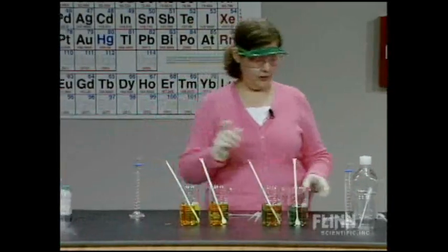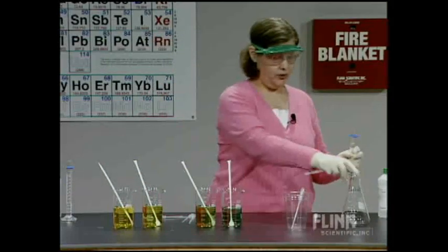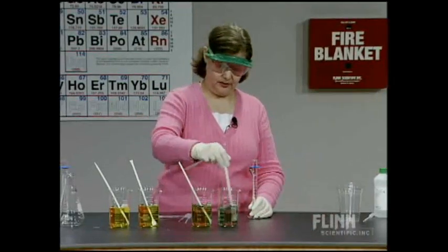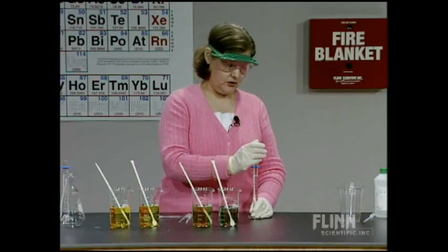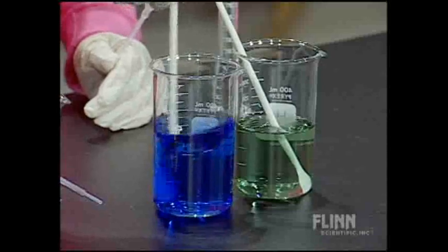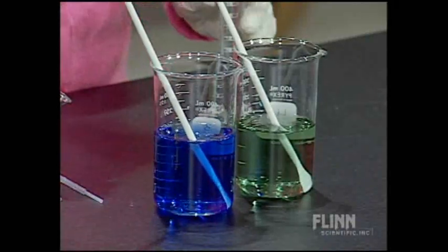I'm going to add sodium hydroxide. Distilled water is in beaker 3, and the buffer is in beaker 4. I'm going to add just one drop of sodium hydroxide to the distilled water — one drop — and it immediately turns blue. That's the basic color. One drop of sodium hydroxide immediately increases the pH to basic.